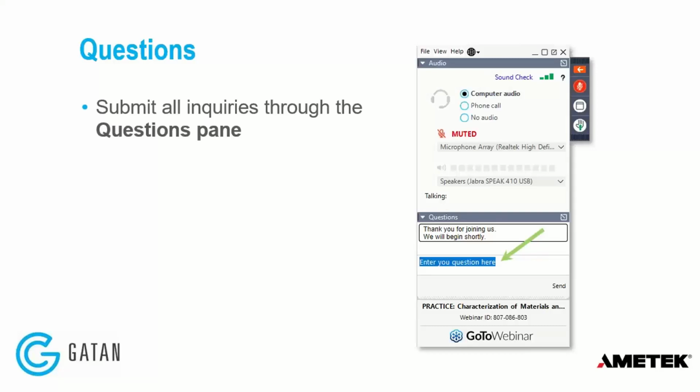And then I have a question here. What is the trace element detection limit? So for CL, it really just depends on the material and what sort of additional elements are in there. But it's not atypical to find the detection limit for CL down in the parts per million range.